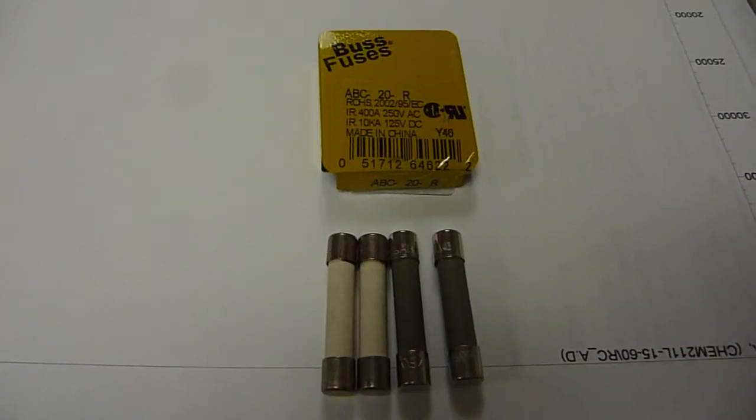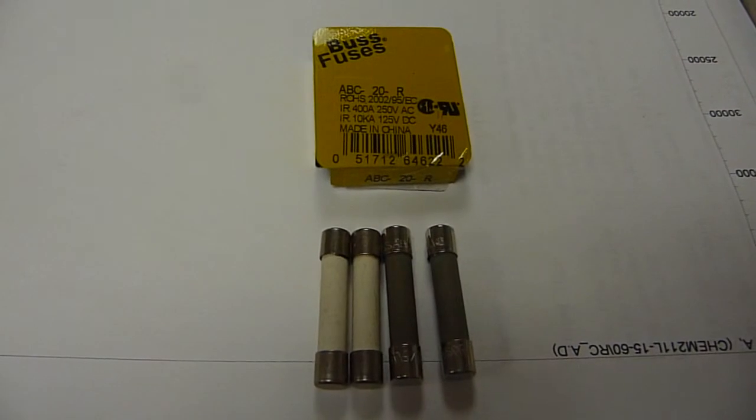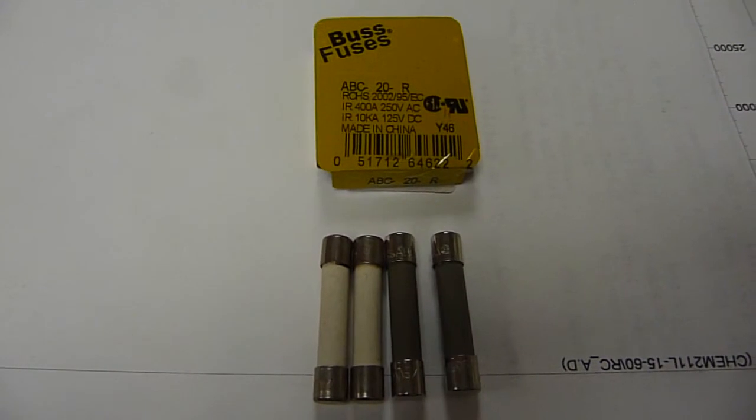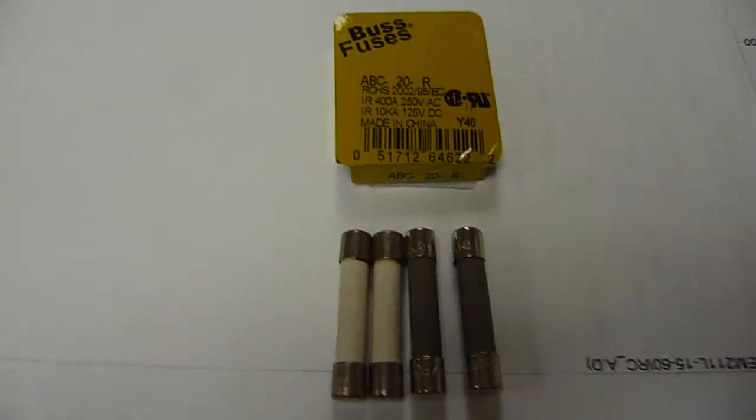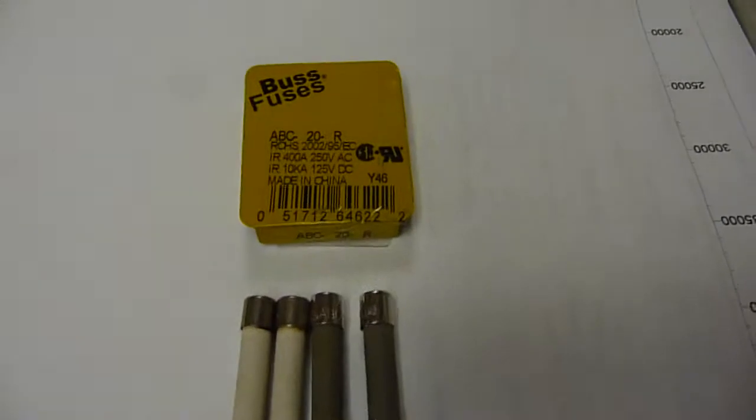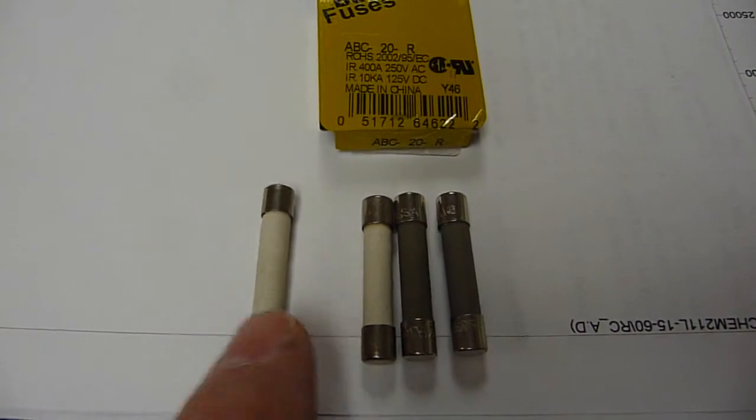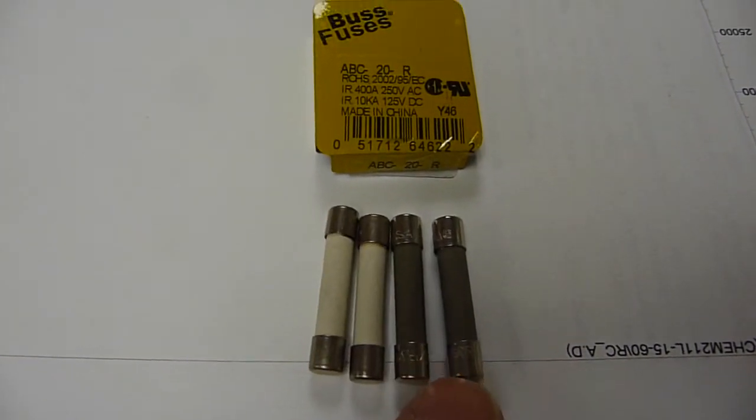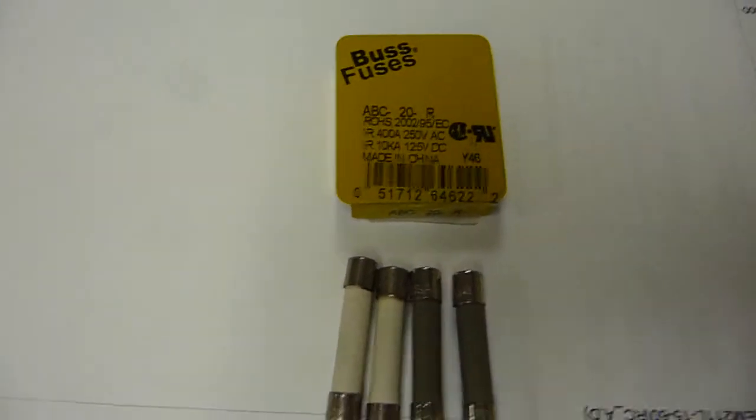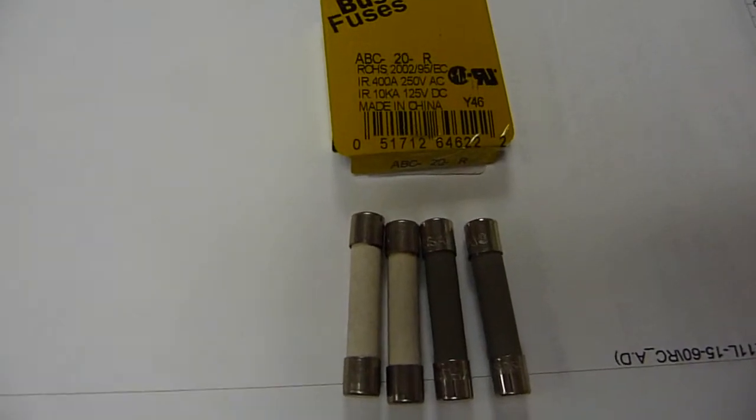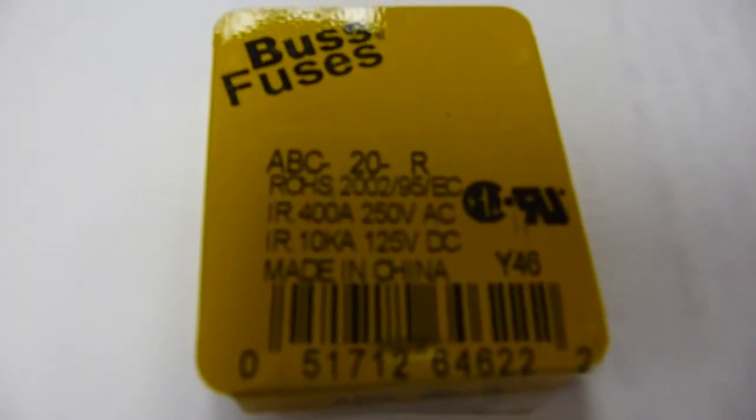I'm replacing the ceramic fuses on the left with 20 amp fuses on the right. Using an ohmmeter, this guy has infinite resistance. This one's okay, and these two are the replacements. Agilent Service Manual recommends replacing them in pairs. So, let's see what happens.